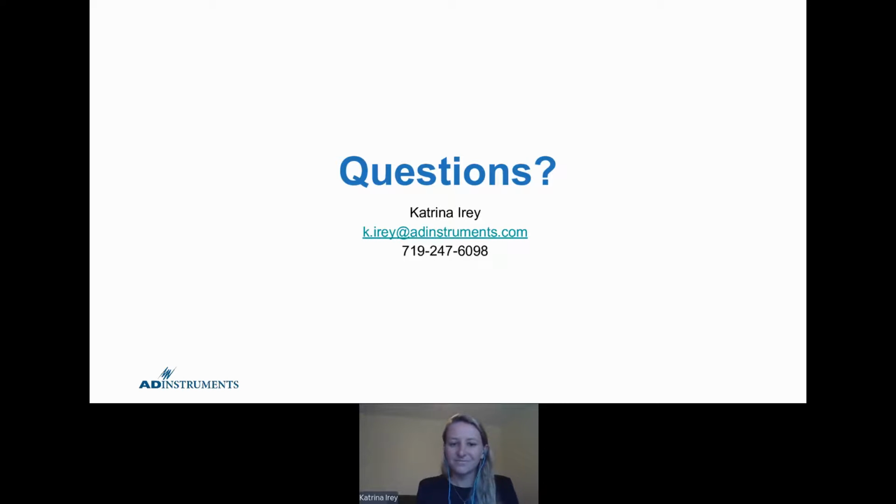Thank you. The next question is asking how many times the battery can be recharged, or if there is even a limit. That is also a great question. To my knowledge, I don't know of any limit. Similar to what I said before, the telemeters are constantly fluctuating in how they're receiving charge from the SmartPad. So that is always changing depending on how the system is running.